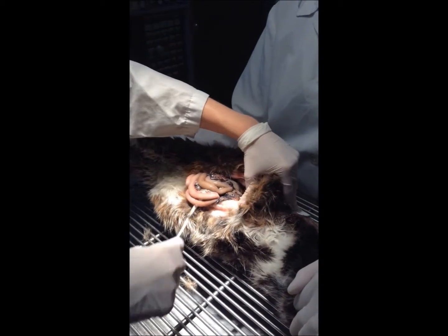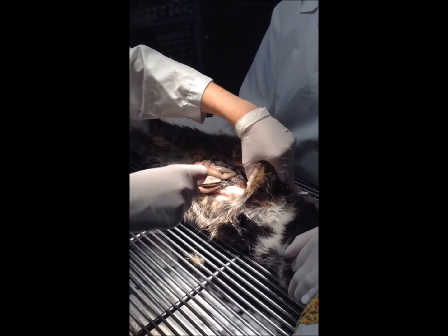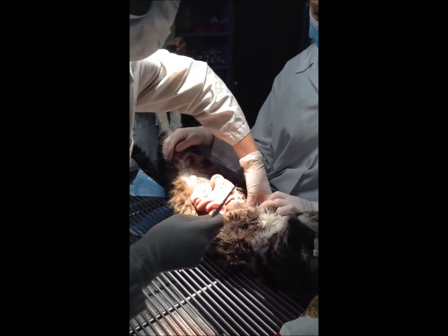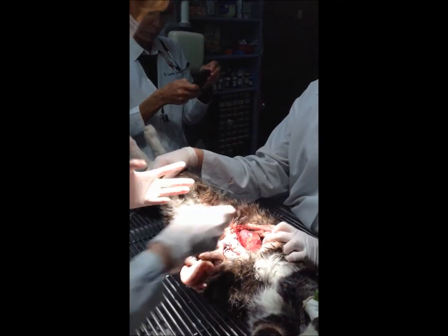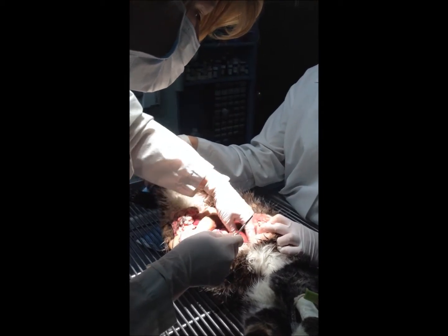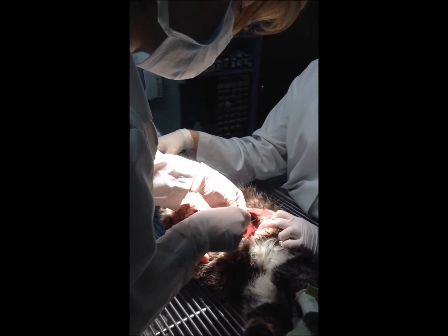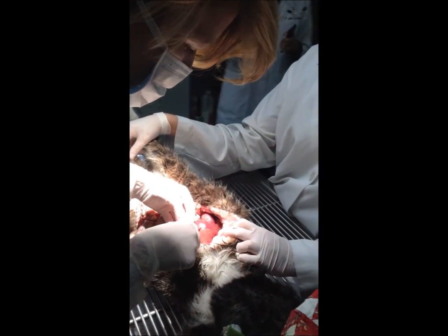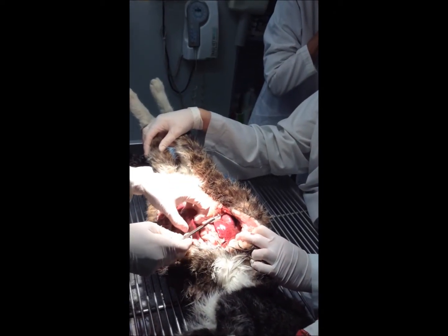Let's see. Do we have a camera again? So we're going to submit a piece of tissue. You always want to take about the thickness of your pinky finger, and get the slice. So let's say we need to submit a sample of liver. So I'm going to cut a piece here. You want to submit these, you usually slice them about pinky size in diameter.